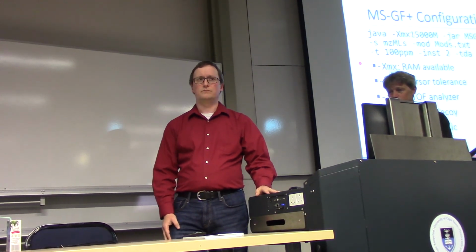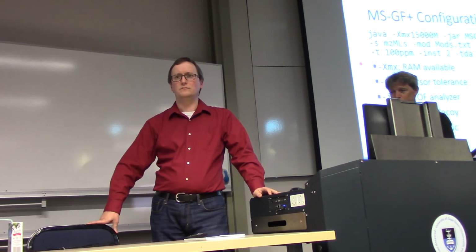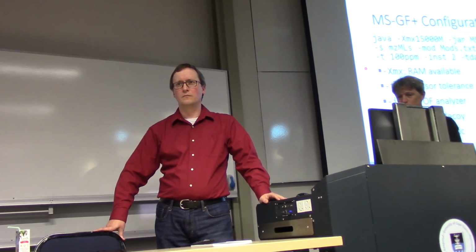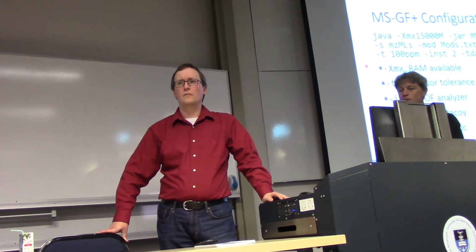If you look at the percentage of your dwell time that you are spending analyzing across there, how much of that gives you high value information, resulting in a good identification? And how much is wasted time spent evaluating a space where you could cut your dwell time down and get more cycles more quickly?